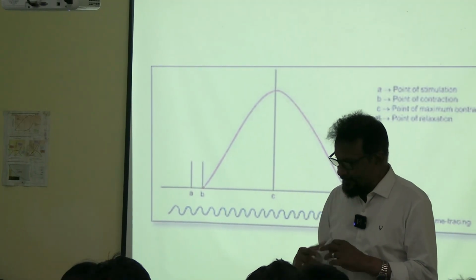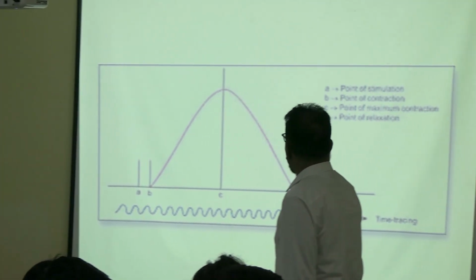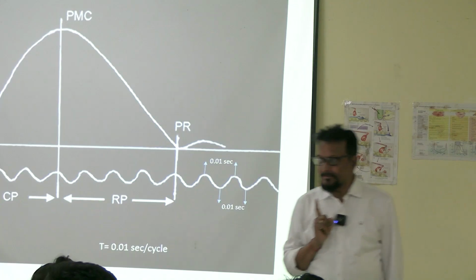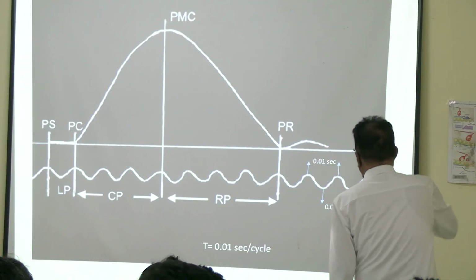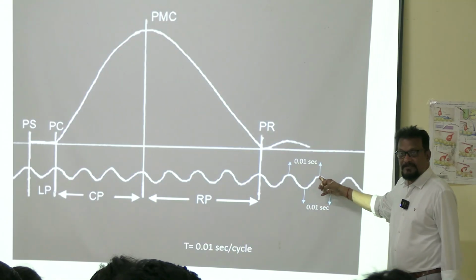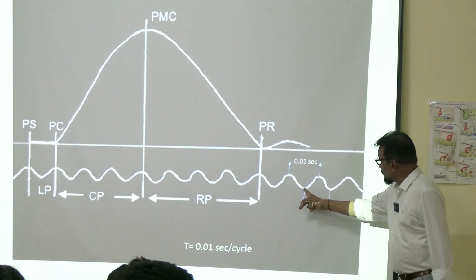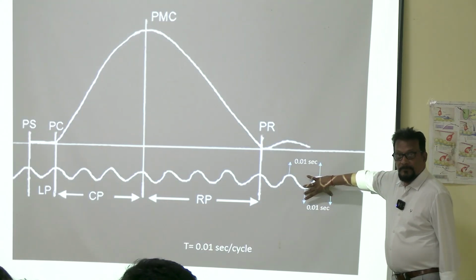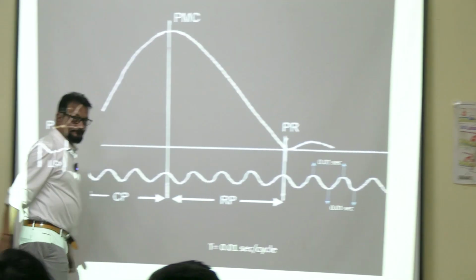How have you used the tuning fork? I explained. Okay. Here 100 cycles means 1 second. So 1 cycle means 0.01 second. From the tip of this cycle to the tip of this is one complete cycle. So this distance is this much. You can also mark from here to here. This is the same. Okay? Now see this. This is the tracing you can have.